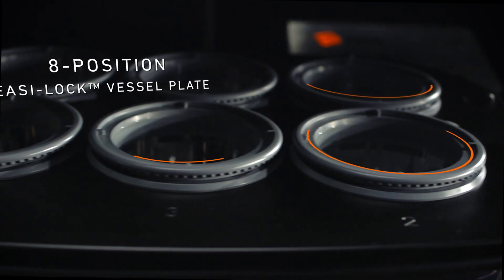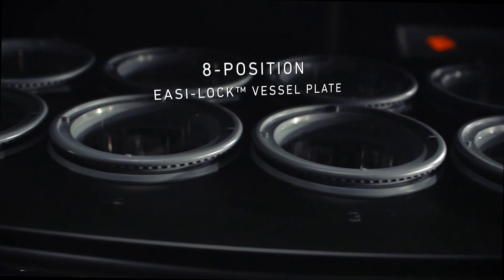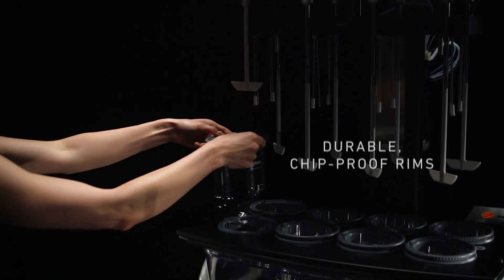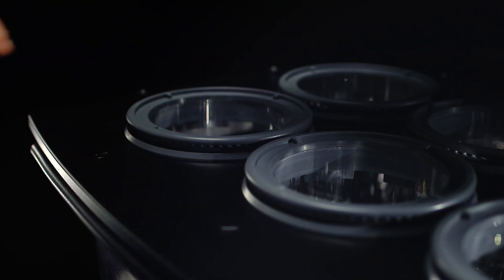The 8-position vessel plate allows for use with 6, 7, or 8 easy-lock vessels. Easy-lock vessels are chip-proof vessels that are self-centering and self-locking, as well as USP and ASTM compliant.